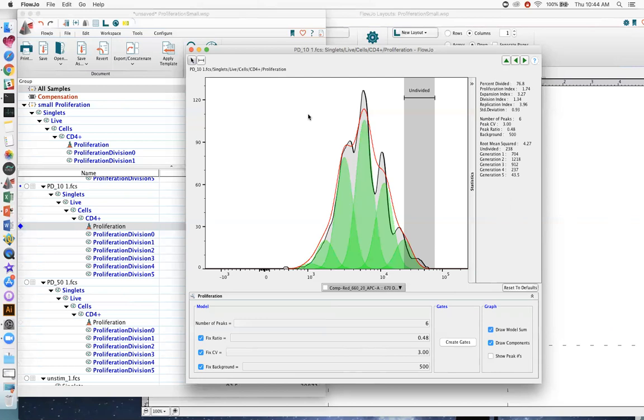But I understand that in some cases, where you only have one control for one patient, you try to apply that model to everything else that you have. Yes, that would be essentially the best that you could do. But I would have a control for each one of the patients, unstim and stim, because patient data are just insanely different. So I hope that answers that question.